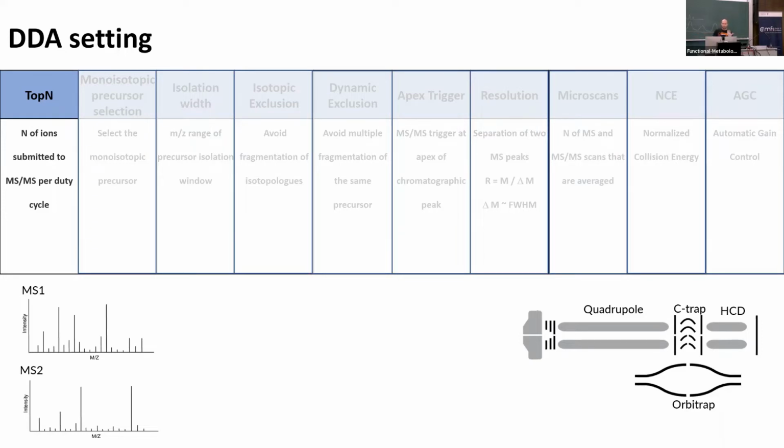Now, unless you have an ultra fast instrument like a timsTOF that can provide fast enough speed, the odds are that you will end up in that scenario and you do not get enough data points. You don't even reach the 5 data points I mentioned before, and you cannot represent any peaks on MS1 level.